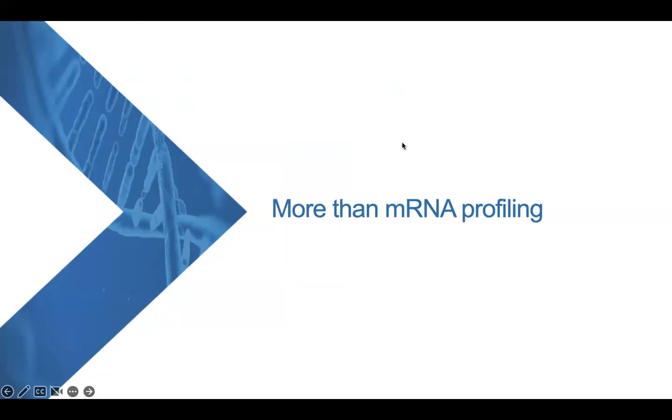So one question is, is the chip any different to a flow cell? You probably mean by flow cell a chip that you actually put into your Illumina instrument in order to get your libraries sequenced. So in that situation, yes, our chip is something different.